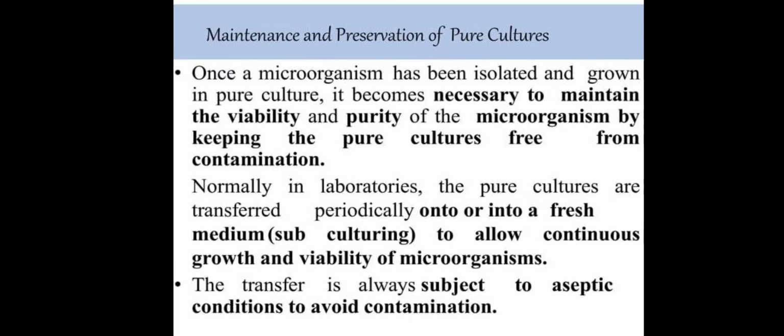Maintenance and preservation of the pure culture. When a microorganism has been isolated and grown in a pure culture, it becomes necessary to maintain the purity of the microorganism by keeping the pure culture free from contamination.